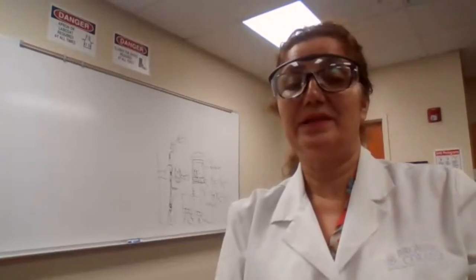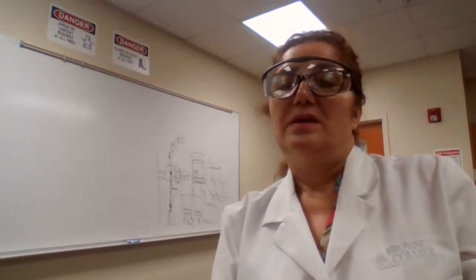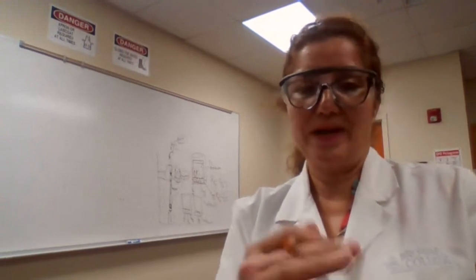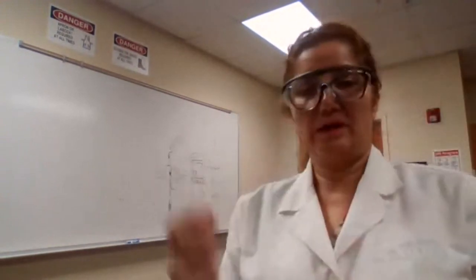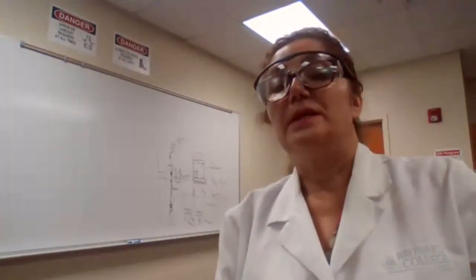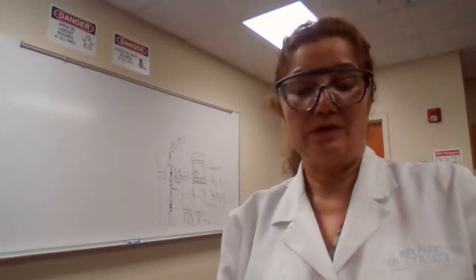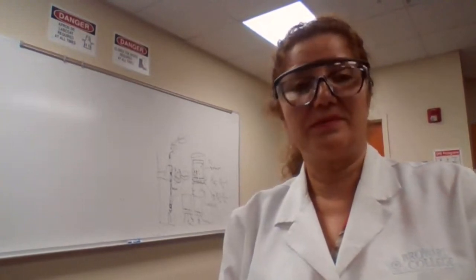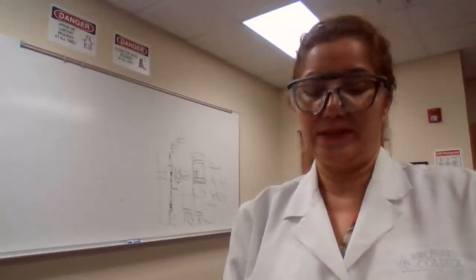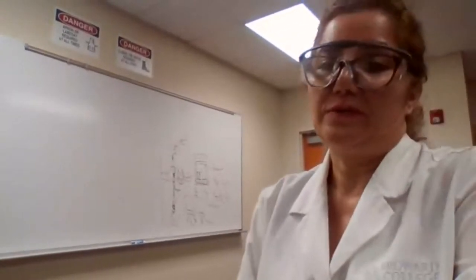Do you have any questions about this experiment? Because if it's a question about this experiment, I like to have it in the record. If it's concerned about something else, then it doesn't have to be for this experiment record. So the question is the qualitative analysis for the second part, yes. For the first part, you have data values, you have the distances, you have to create the table and do the calculation, show your calculation, because any calculation that you are performing has to be shown in the lab report for the first part.